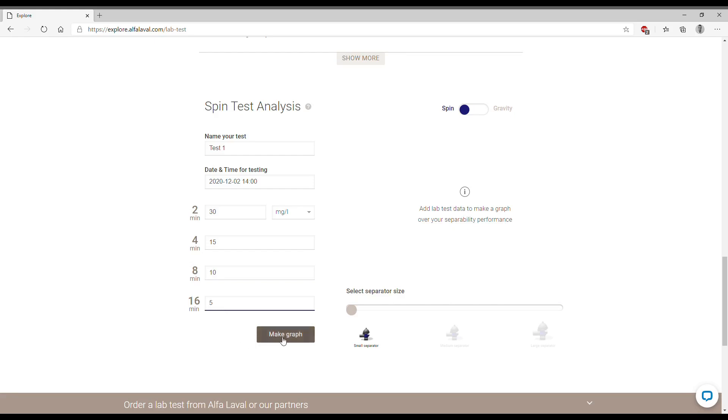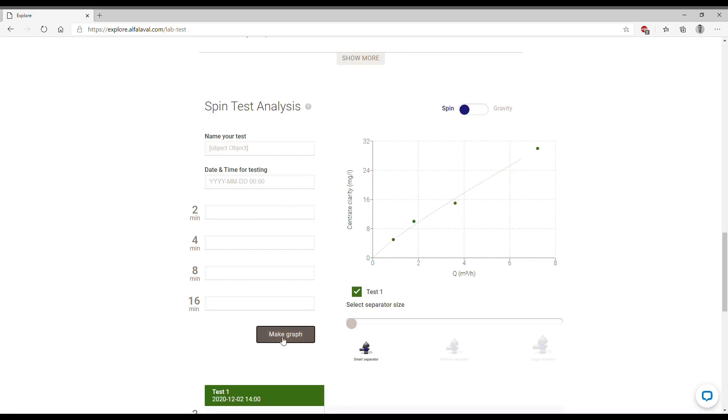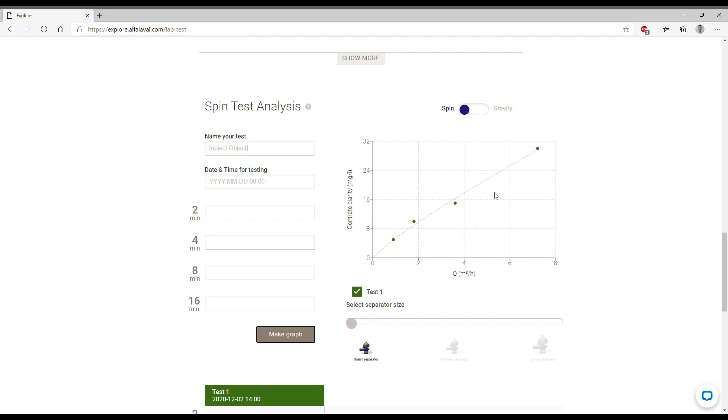We can then make the graph which will be the one showing the scaled up results. So this is how the results look like in this graph on the right and you see now that we selected a small separator. This graph is basically telling us that based on the results of the spin test we should have this performance when choosing a small separator.